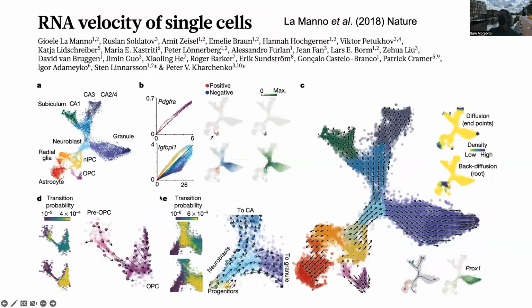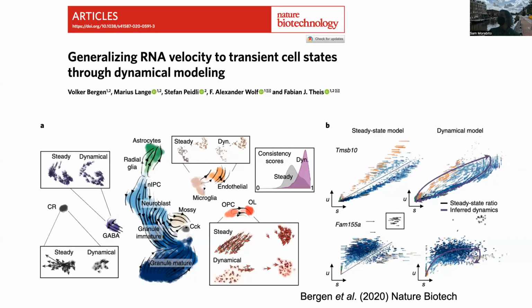This original method doesn't have a pseudotime calculation. I didn't show it in this figure, but scVelo does have a way to extrapolate from the velocity to pseudotime, which is a nice addition. A lot of the older ones, like the ones I was showing first, are semi-supervised, so you tell them where the start or the end is. This one is different: the directionality comes from the arrows.